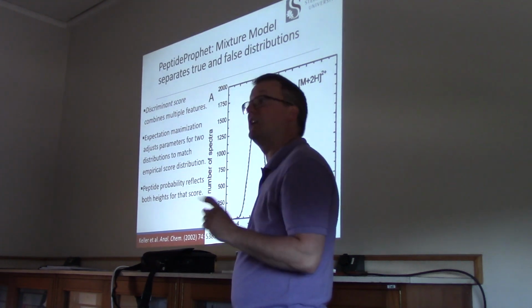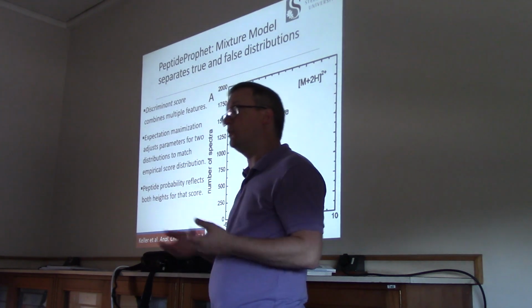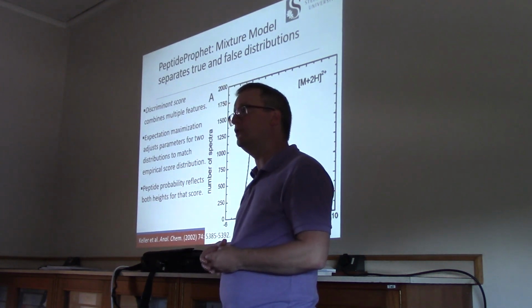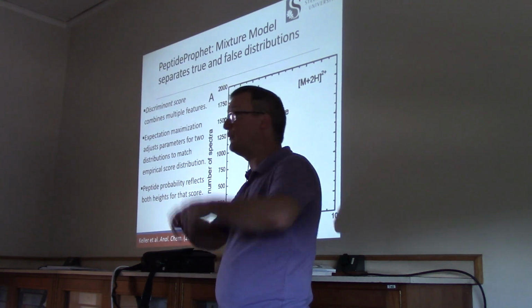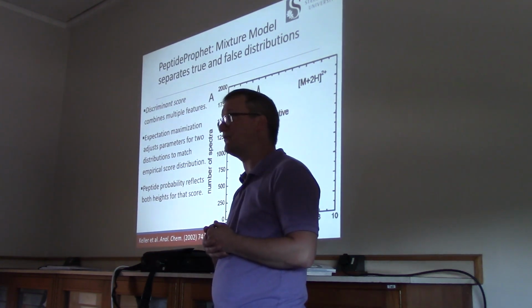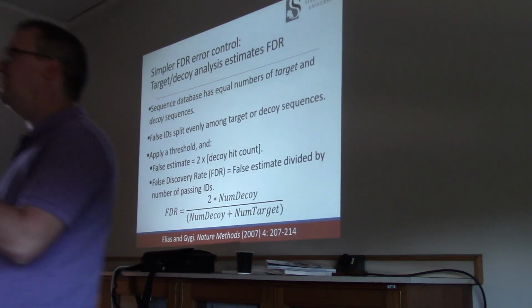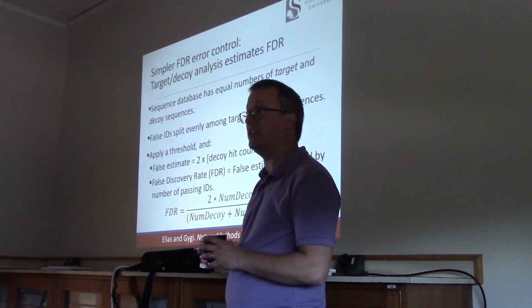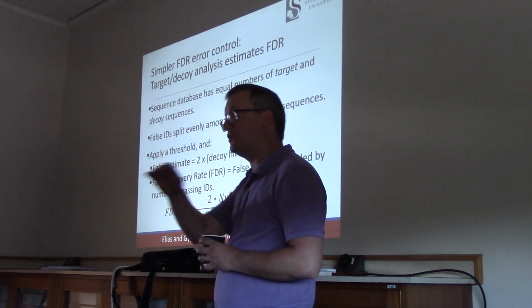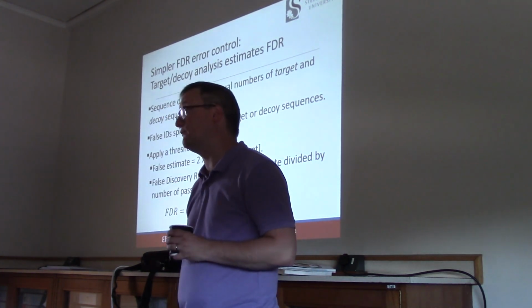And it's not rapid either. If you've used TPP for your PSM evaluation, you know it's going to take a few minutes to run through all of that, or much longer if you have a very large set of spectra that you're trying to make sense from. So this process gives us the ability to evaluate the error probability for each PSM individually. Very powerful, especially if your information that you're going after is correctness of this particular phosphopeptide, for example.